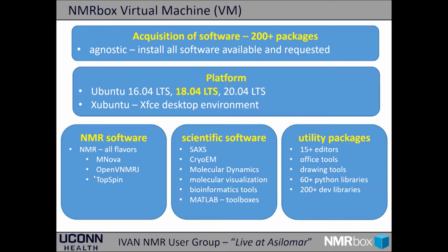For NMR software, we have all flavors of NMR software: data processing, analysis tools. It covers the entire range: solid state, solution. Way too many software titles to outline. I'll just make note of a couple. We do have Open VNMRJ and Topspin, and we also have MNOVA, which is one of only a couple commercial software packages that we have. And we actually have a university site license to distribute MNOVA to all of the NMRbox users.